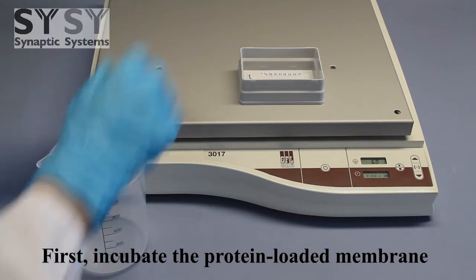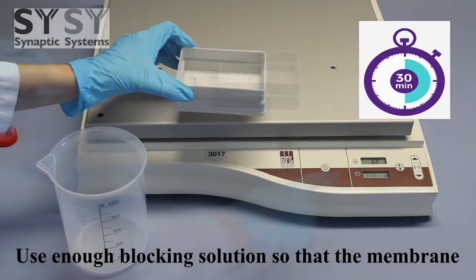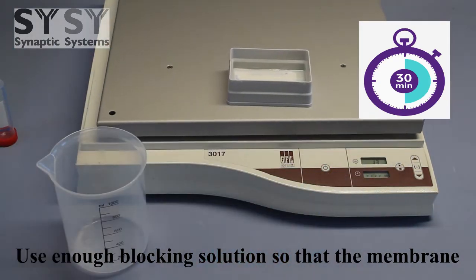First, incubate the protein-loaded membrane in a blocking solution on a shaker for 30 minutes. Use enough blocking solution so that the membrane is completely immersed.